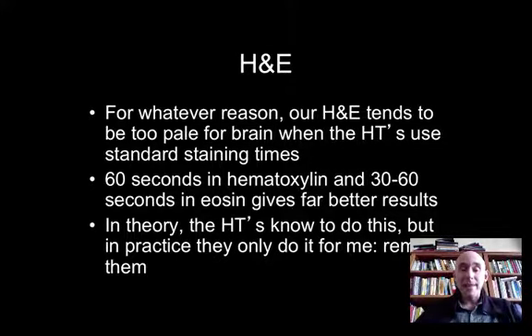So you must let the material sit in the hematoxylin and sit in the eosin for longer than you would with a frozen section. Basically, I tell the techs to leave it in the hematoxylin for 60 seconds, not to rush it. And then for the eosin, anywhere between 30 and 60 seconds. Usually for simplicity, just 60 seconds is what I tell people, to leave it in the eosin.